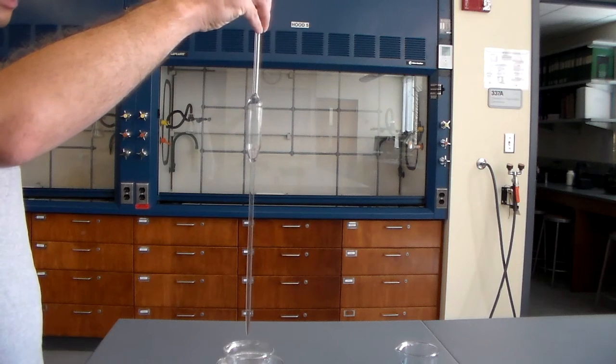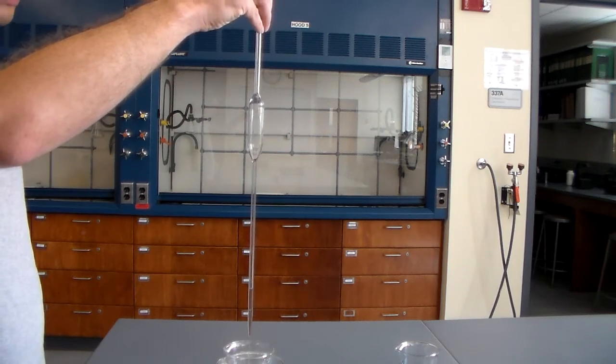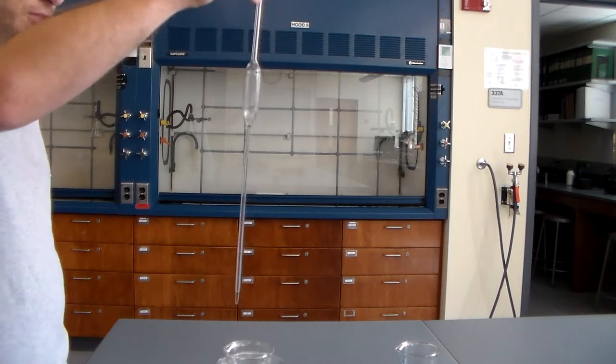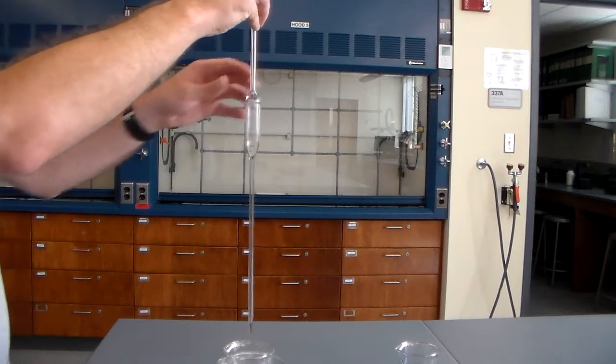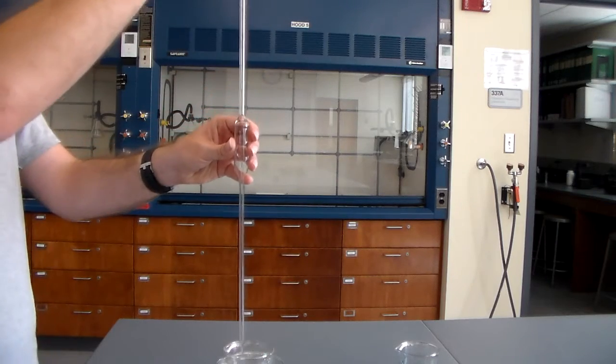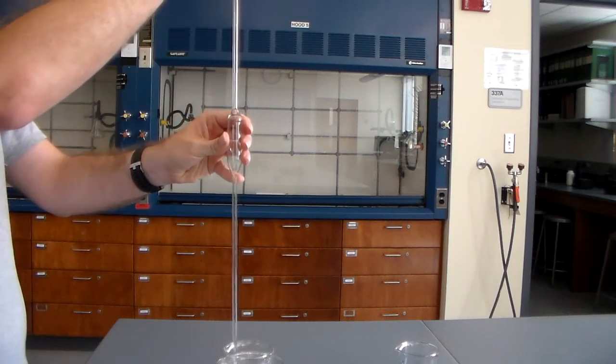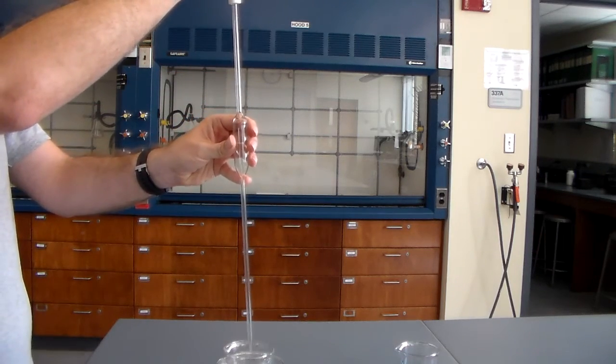And you may do this 1, 2, 3 times, however many times it takes you to be satisfied that the inside is actually clean. This particular one is actually pretty nice and clean here, so we don't need to do much more with that. Alright, you may notice that there's a little liquid. It's okay to blow this stuff out now because we don't want this diluting our next sample.